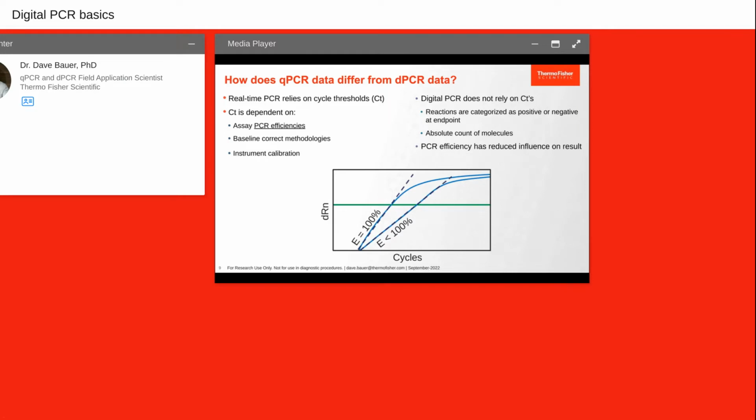But with digital PCR, we're not looking at the progression of the reaction. We're not getting CT values. We're just making the binary distinction of, do I see signal or not? So basically, we're looking at the very end of that graph. As long as the blue line got above the baseline noise, that's a sufficient amount of amplification for digital PCR to do what it needs to.